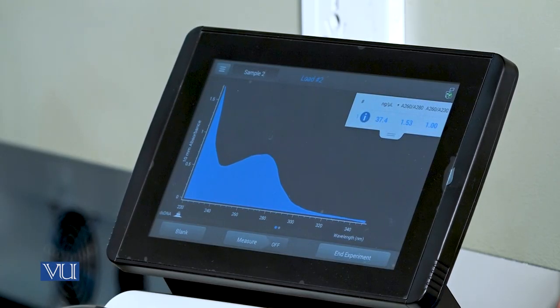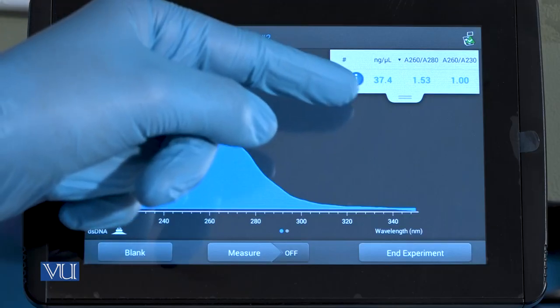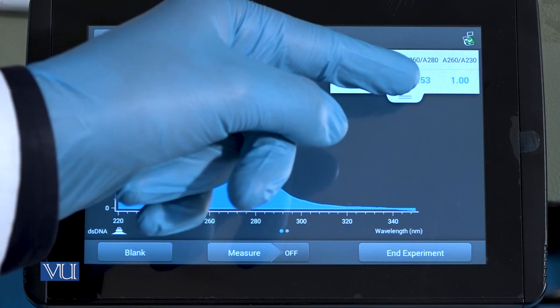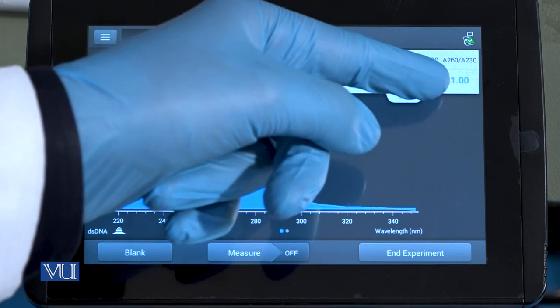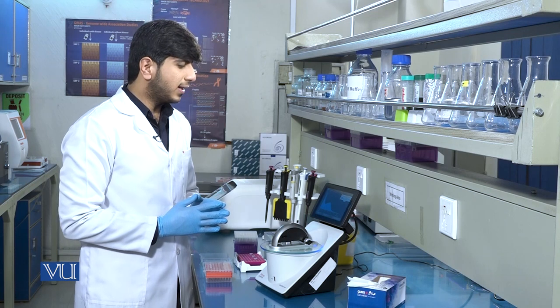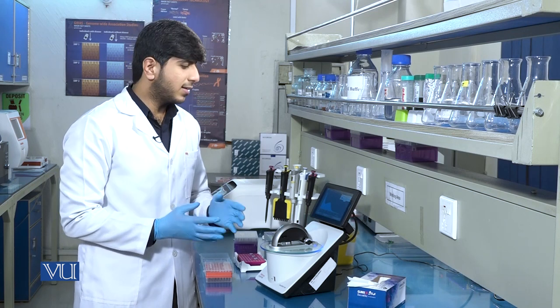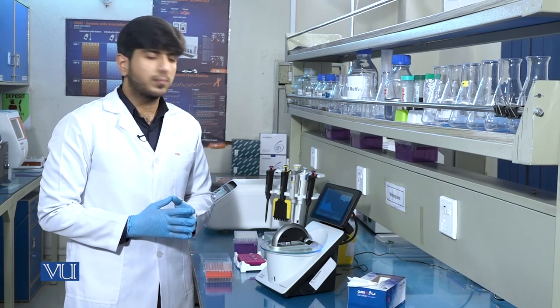There are 3 values. One is nanogram per microliter, which is the concentration of the DNA. Another is the A260/280, which gives the purity of the DNA, and again A260/230, which also tells us about the contamination present in the sample. In this sample, we can see that the concentration of DNA is just 37.4 nanogram per microliter, and the purity of the DNA is about 1.53. Normally, the purity of a pure DNA sample is at a 1.8 ratio.